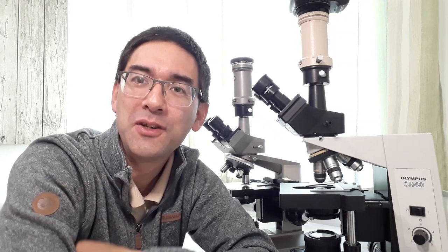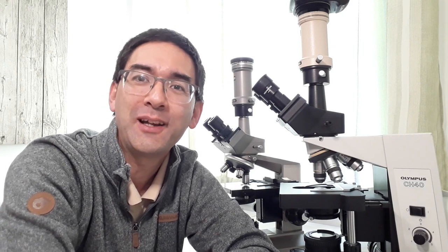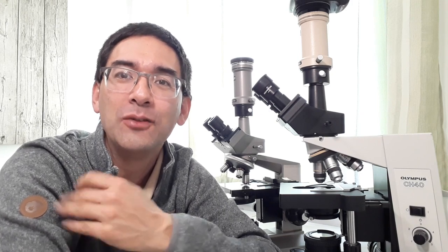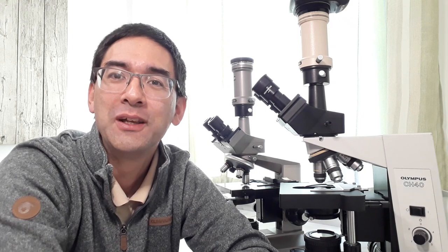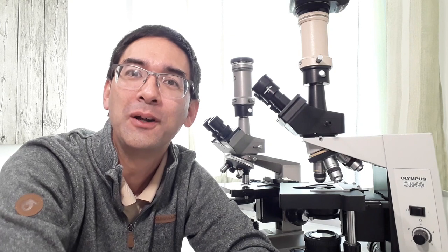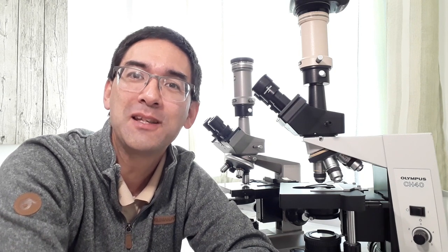So what I'm going to do in this video is talk about my microscopy tools and accessories that I use, and I'm going to specifically talk about the field box that I've made. Basically, into this field box I put all of the accessories and tools that I take out into nature when I do sampling for collecting specimens for microscopy.